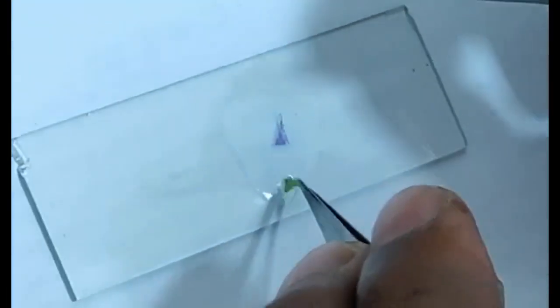So only the useful part we are keeping with us on the slide. Waste material is removed from the specimen.